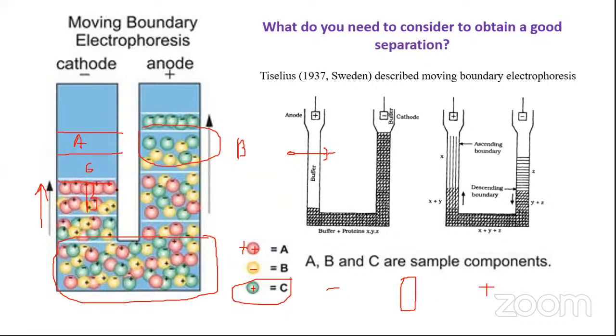Imagine now that A is moving from this crowd of B negatively charged molecules and slightly positively charged C molecules, and is trying to reach the cathode. It's going to pass through all these molecules, the crowd of all other molecules. And during this process, will it not be causing a large amount of friction while moving towards the cathode?